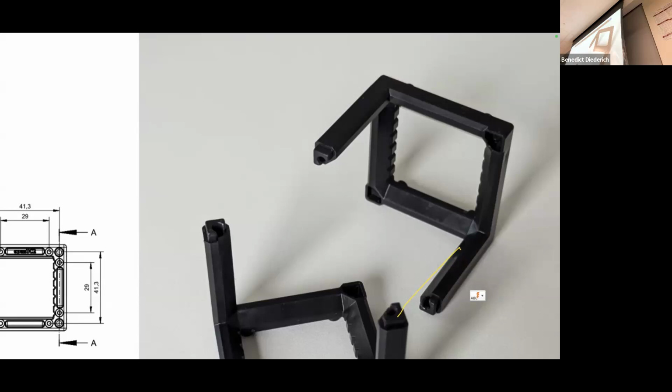But what if the beam cuts? Along this direction, it will just propagate. What's happening, if you look in time, it will go up and down, basically. So if we have something in the way, let's say a mirror with 100% reflectivity, it will just, oh, my skills are like this. Okay, so it will just be reflected. So at 100%, you see that on the table.